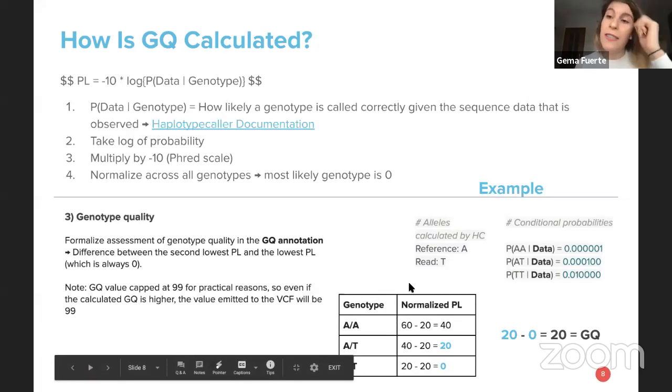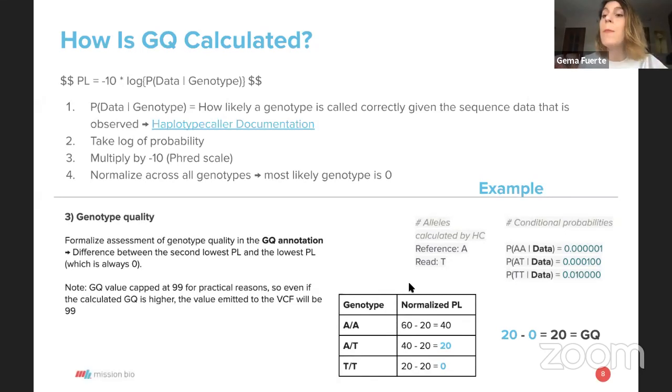For all of the filters, I'm going to be telling you some exceptions on when you should change this threshold. For this one in particular, you can think that if you go up with the genotype quality, you are more stringent. You are going to be removing variants, but you are keeping the variants that are present only in very, very high quality cells. If you go down with your quality, you will have a lot of variants, but you likely will be introducing false positives. So this filter has really big importance when you change the percentage of mutated cells.